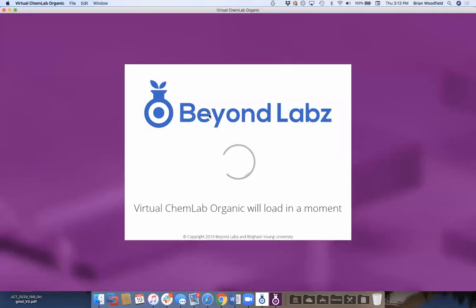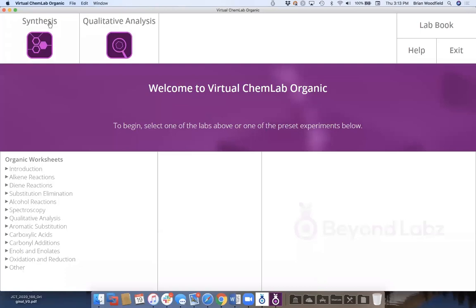So with organic chemistry, we have 2 lab benches. Each of the products has these lab benches, and each of the lab benches is like a self-contained, open-ended place to go do a set of experiments. So this is our landing page.